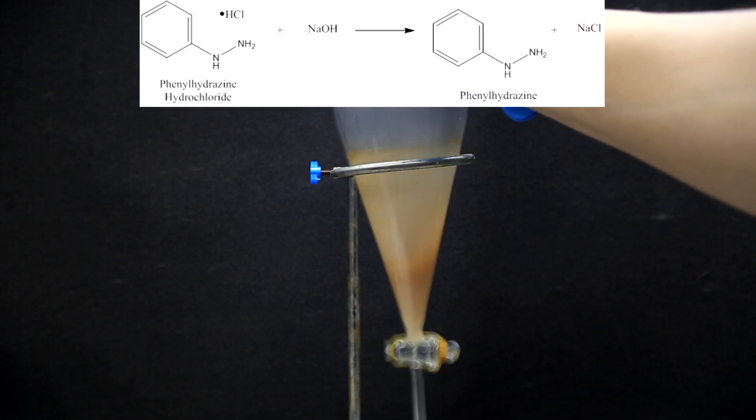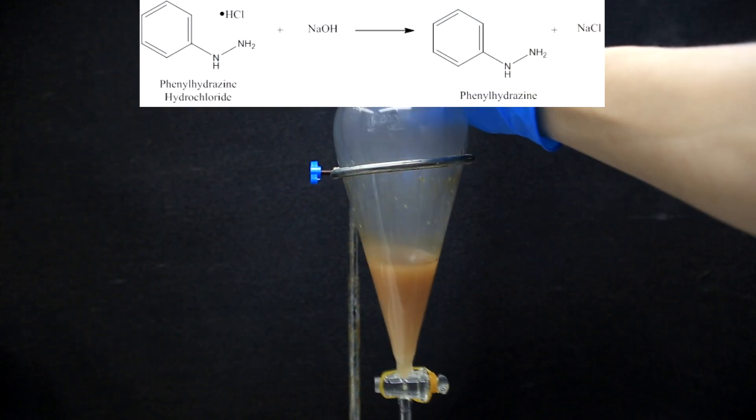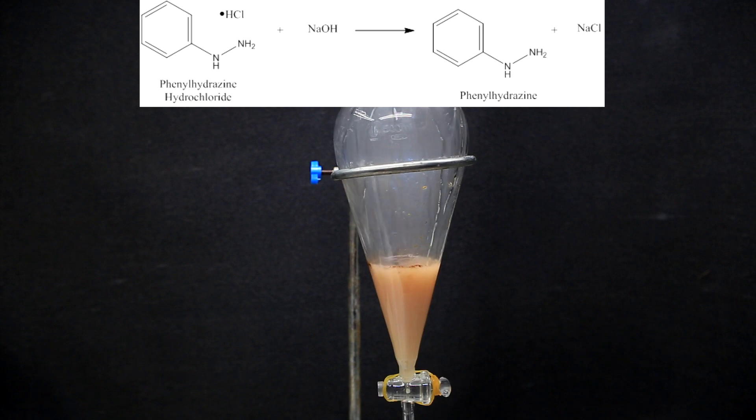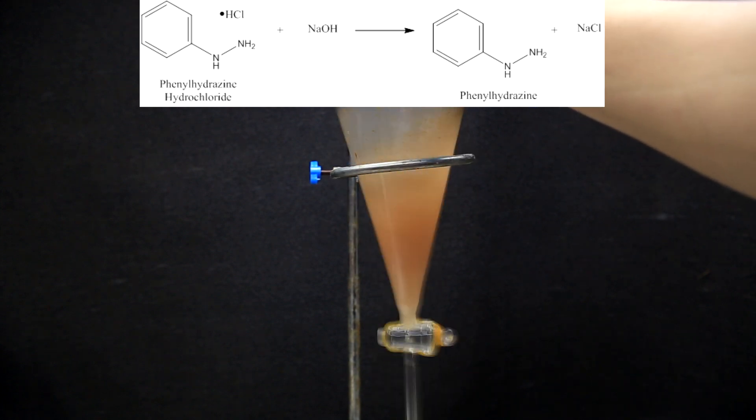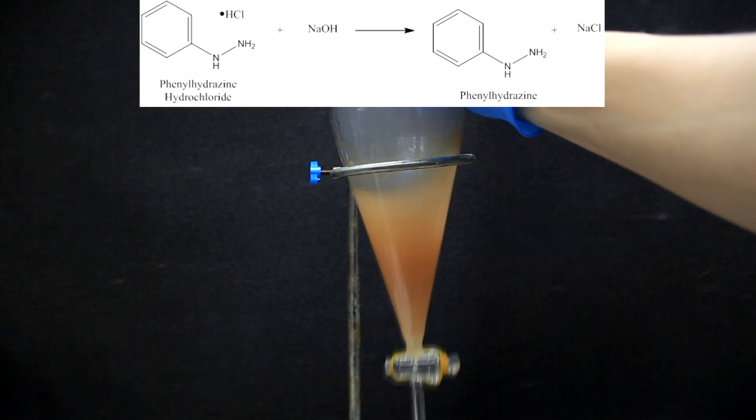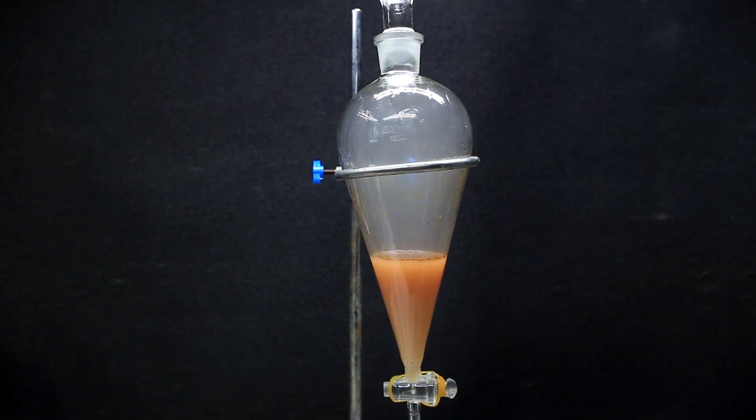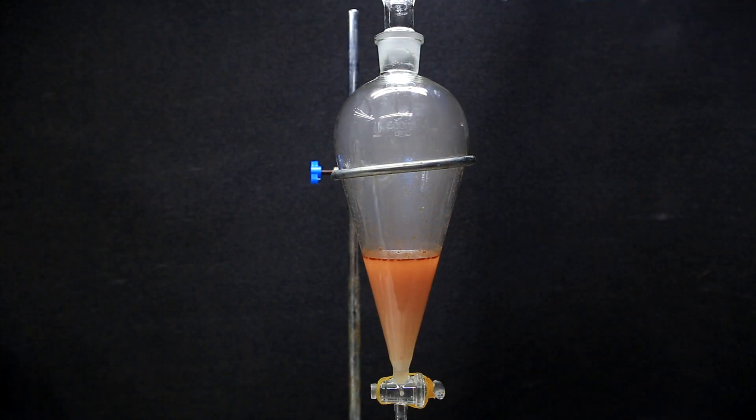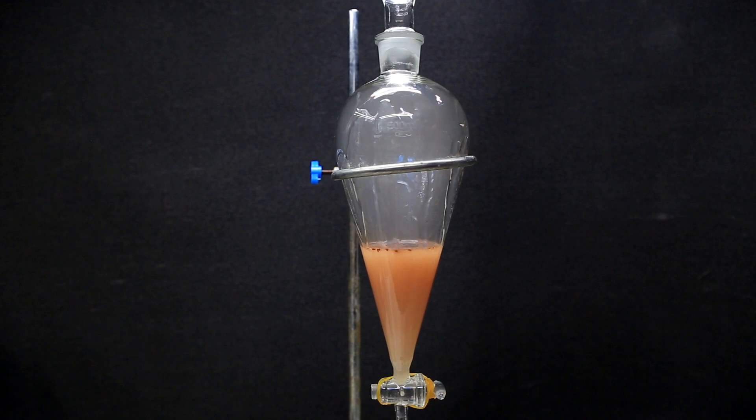So what we start with is phenylhydrazine hydrochloride and when it's reacted with the sodium hydroxide, we get the freebase phenylhydrazine and sodium chloride. The freebase will be soluble in organic solvents and the sodium chloride will remain in the water. In the end, I probably used way too much of the sodium hydroxide solution but it doesn't really matter.